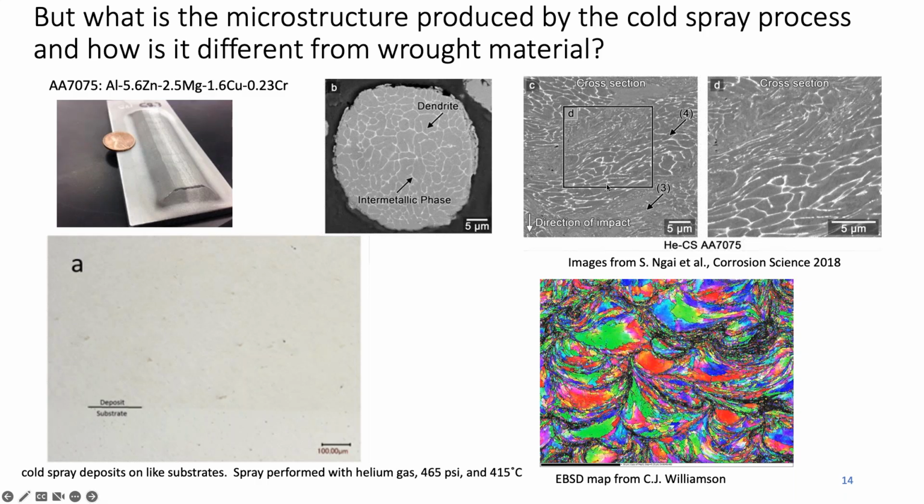One of the things to keep in mind in cold spray is that we don't really reset the microstructure. So if you used a fusion-based additive technique, well, it remelts the microstructure and then it resolidifies. Now that can cause its own issues. In the case of cold spray, we simply take this little ball that has this microstructure and we impact it at high velocities into the substrate or into another previously impacted particle. So you can actually see the prior particles.